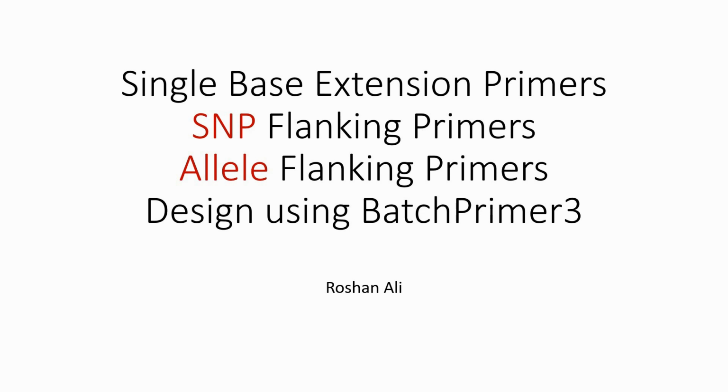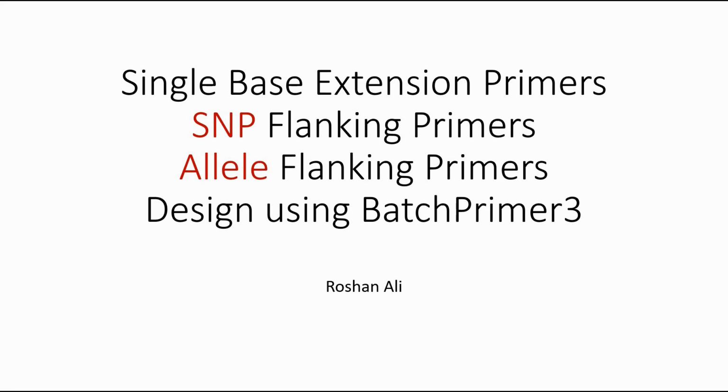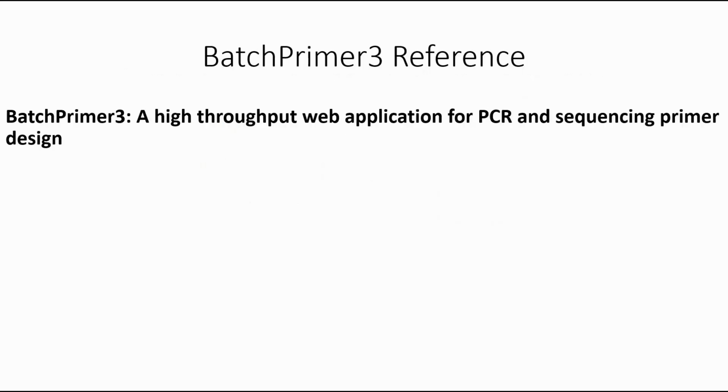SNP or allele flanking primers means the same thing. However, single base extension or SBE primers are different from SNP flanking primers. I have already explained in detail about BatchPrimer3 server in my previous videos. Here in this video, I'm just going to tell you the reference of BatchPrimer3.